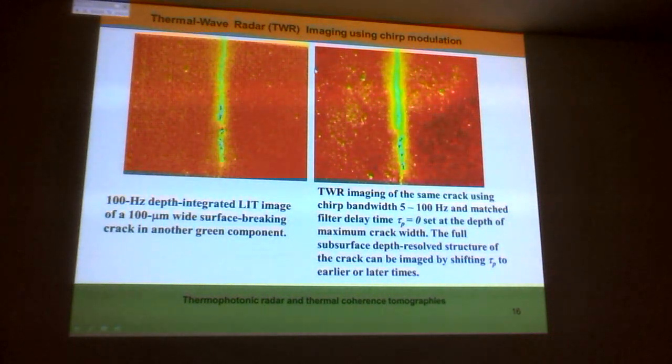So can you remind us what the wavelength of the laser is and what the sensitivity is? For this particular sample, the spectral sensitivity doesn't matter, because the laser is a heating source. In this case, we're using diode lasers from Germany, Genoptic, from Jena. Typically, I can go up to 20 to 30 watts, 40 watt peak power. I can have more if I want, but then the modulation frequency is relatively low, so there's no problem with that.